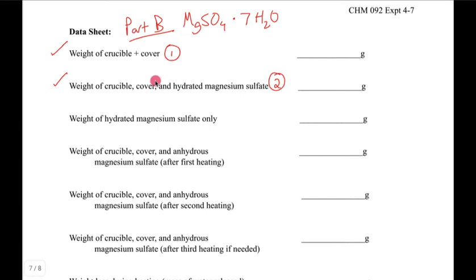So like I said, you take the sample, you heat it, and you drive off the water. Well, oftentimes the first heating doesn't drive off all the water. Okay, so I did one heating and I did not record the mass for that, so don't worry about it. I did record the mass for the second heating and it was fine. And so this will be the third data point that you'll see. And then the third heating was not needed.